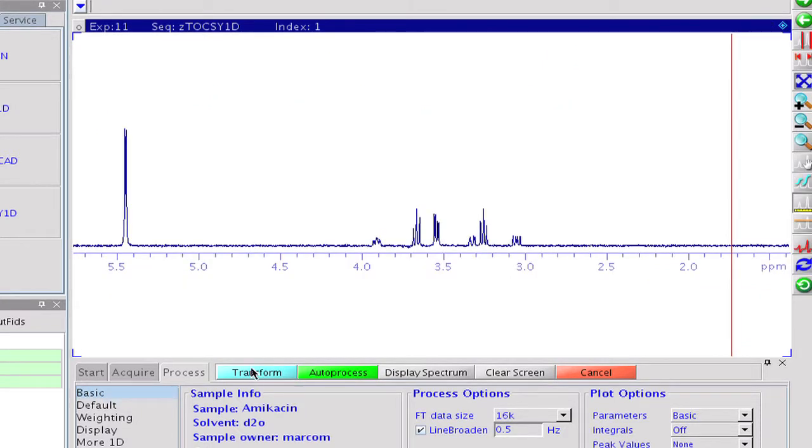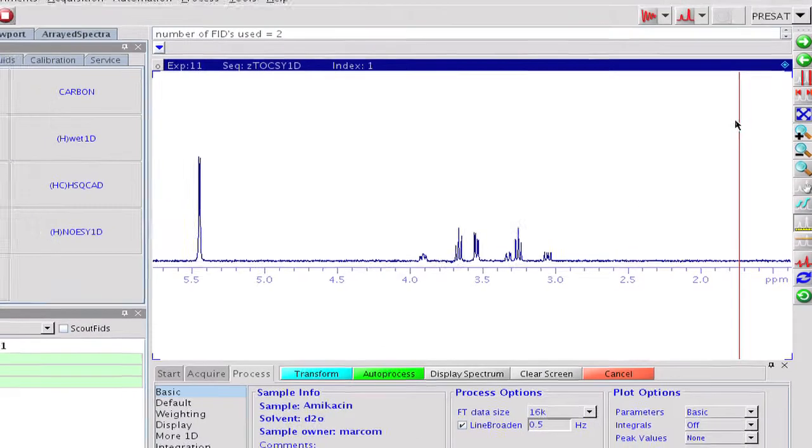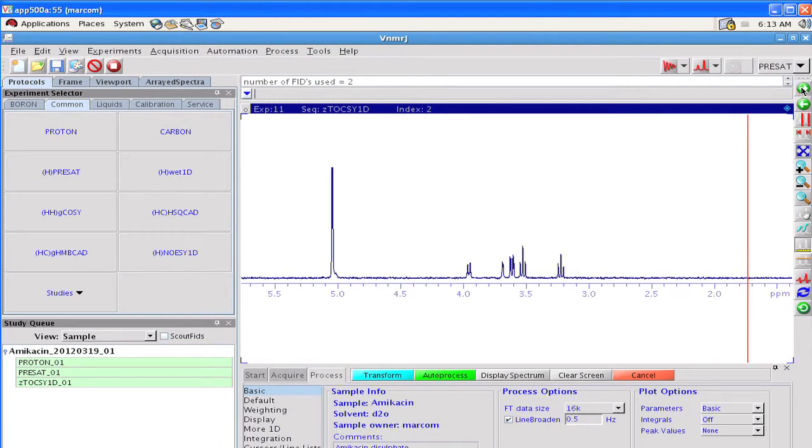We have now the sugar ring that has its anomeric proton at 5.5 ppm. The spectrum is clean, there is no crosstalk from other spin systems, the multiplets are undistorted, and high-resolution conditions are fully retained. Coupling constants are easy to extract and can be used to determine the relative configurations of the asymmetric carbon atoms in the sugar ring. A renewed Fourier transform makes the second sugar subspectrum accessible.